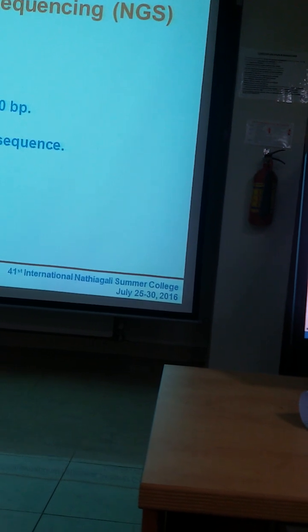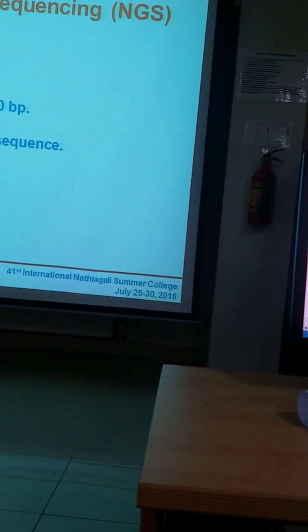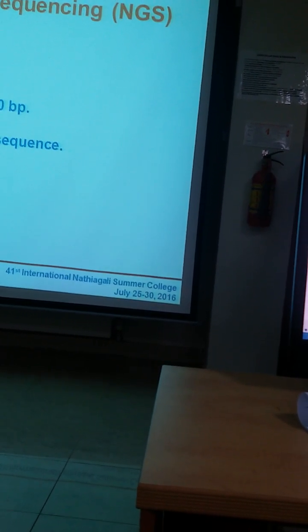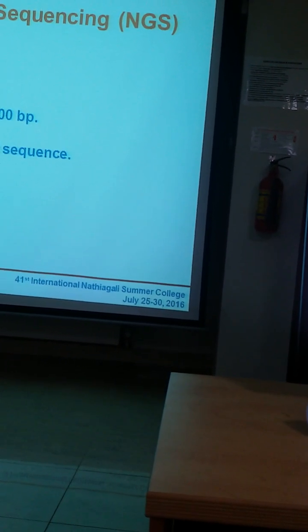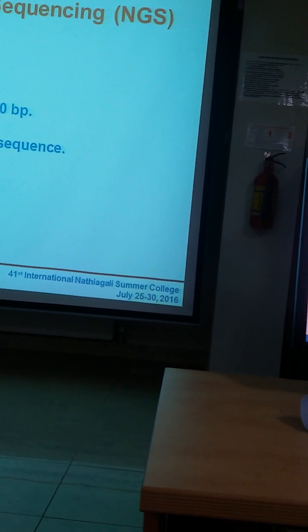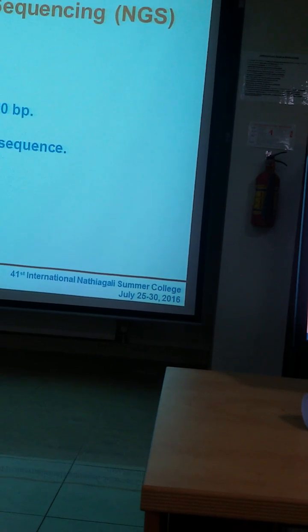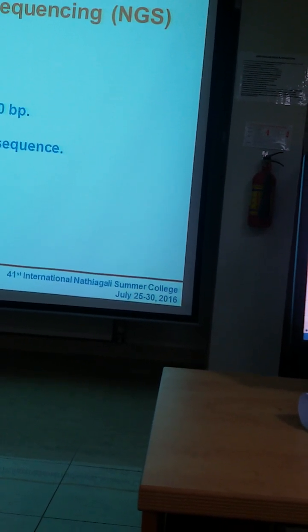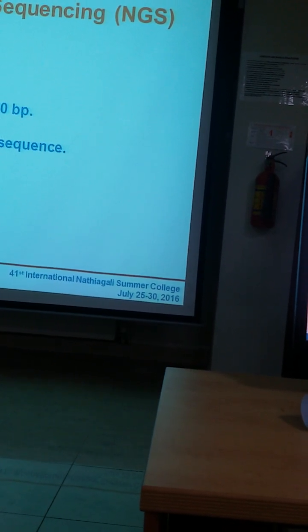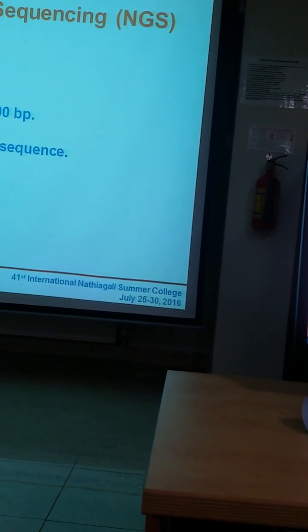For the 1,000 Genomes, the pipeline they set up is basically what they're using. They've chosen a reference which now is, I think, build 38. They map it to that reference and call the variants using GATK. That's pretty much standard across the institute. And like our group, after they map those, we get the BAM files and the raw BCF files, and we basically do what we want to do.